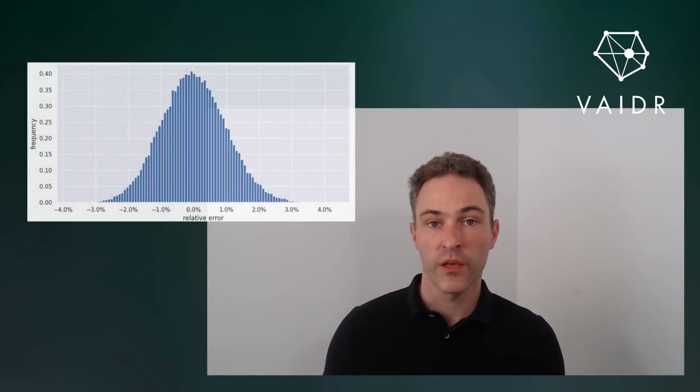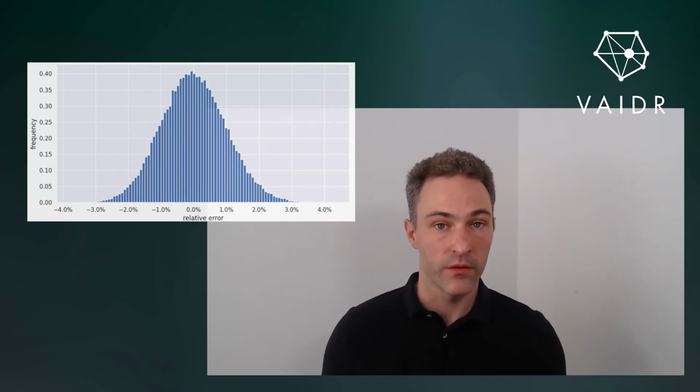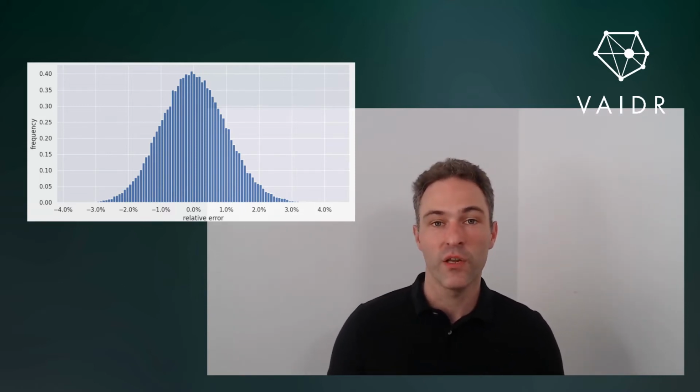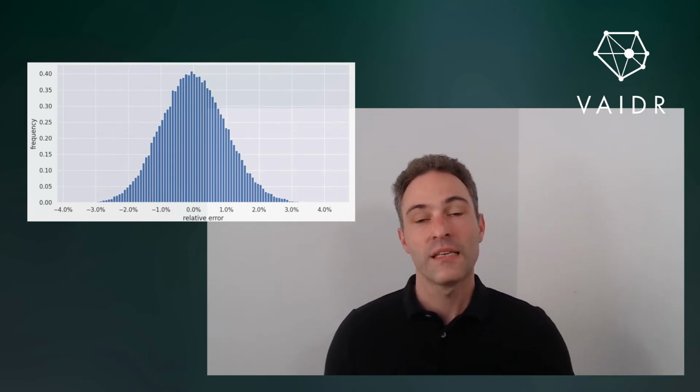we did a small resampling simulation where we determined both numbers for smaller sub-images and then combined those numbers, added them up for virtual full images. We found that the relative difference between the measured network length and the scaled number of pixels is just plus or minus 4% at most. So that tells you that whenever you need the network length, you can just use the numbers of pixels that are segmented as neurite in an image.